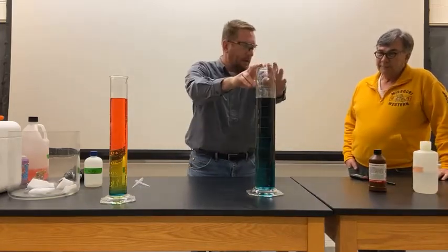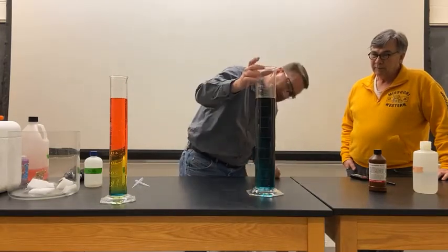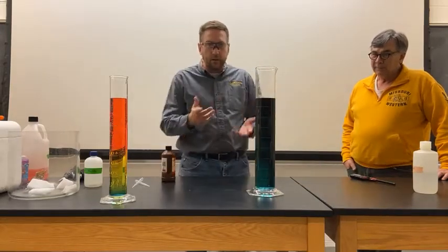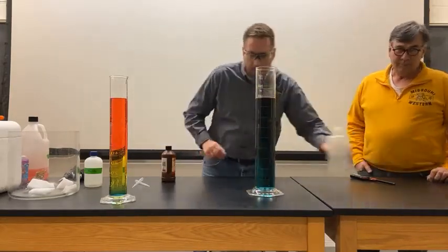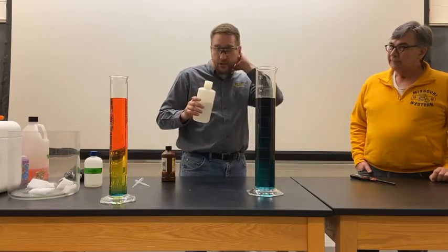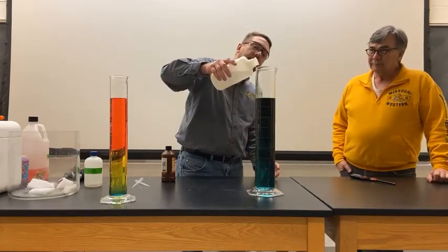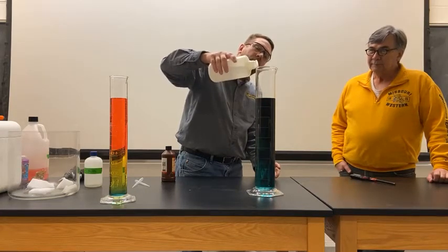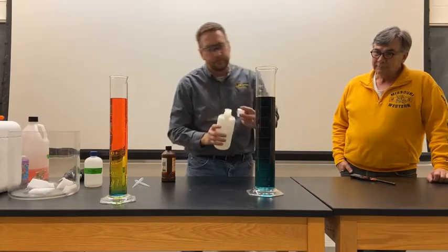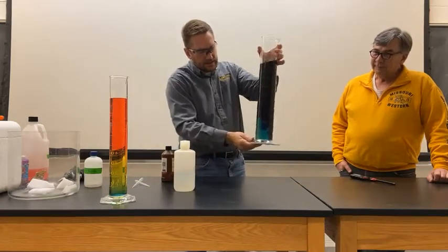All right, so what I have in here right now is some water and universal indicator. So you see that it's kind of a blue-green color, which is exactly what we would expect. The water should be pretty close to neutral at this point. Now I'm going to add some sodium hydroxide to this. So I'm going to intentionally make this basic. Now when we do this, we're going to see the color change, and it'll become a very dark blue-purple when we add it. So I'm going to allow that to mix here for just a second so that you can see that nice blue-purple color.